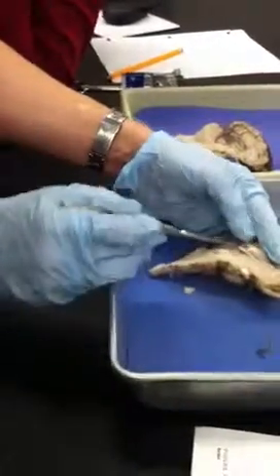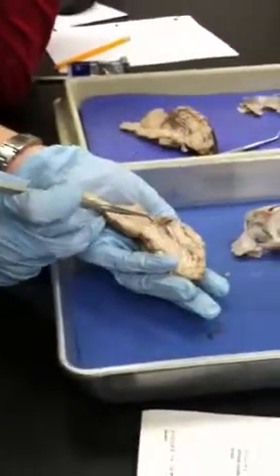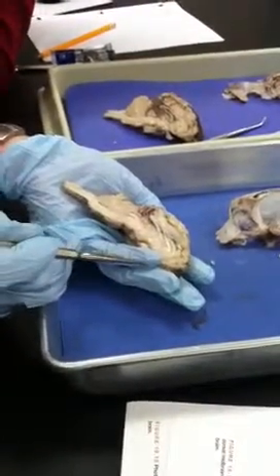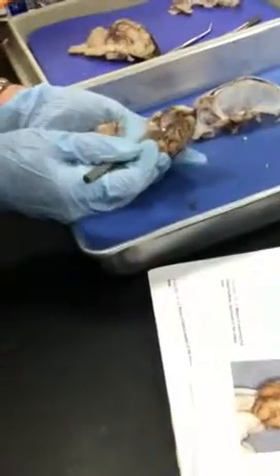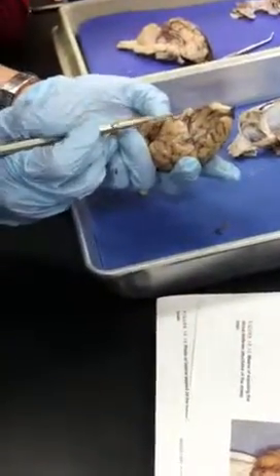Don't get confused. Superior and inferior colliculi. This here is what? That's the pineal. So you see the body there, on the dorsal part. The dorsal has the corpora quadrigemina, the pineal gland and the cerebellum. The ventral part has the olfactory bulbs and tracts, optic. It's really hard to see on this guy. Mammillary bodies, not so much.